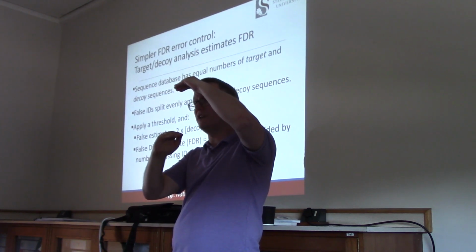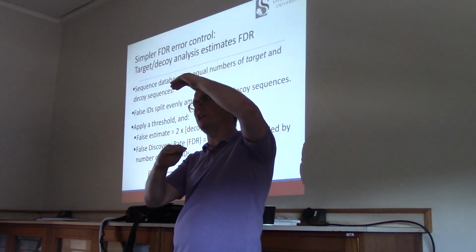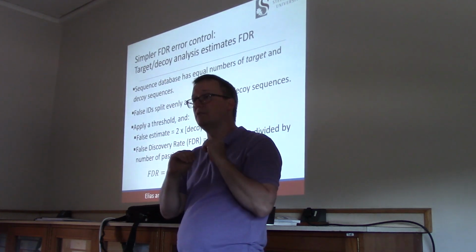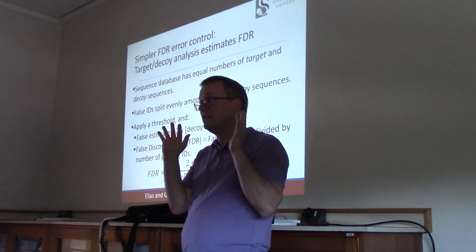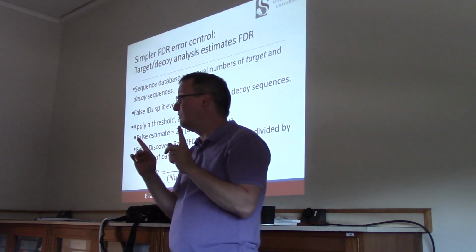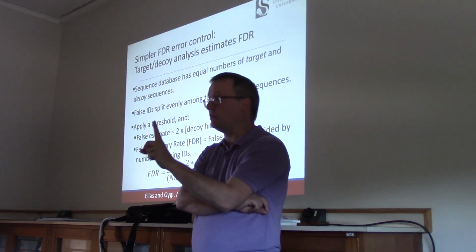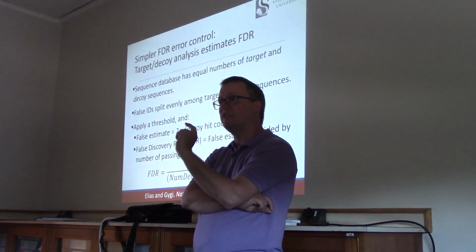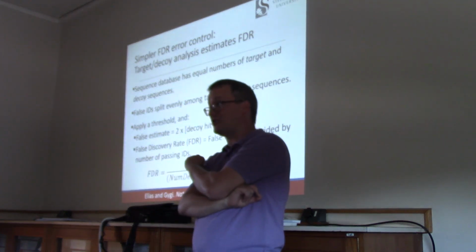Now, what if I lower the bar and I add to our collection a PSM that is associated with a target sequence? Do we know its status? We don't actually know. Because that sequence does exist in nature, it's possible that it was correctly identified. But it's possible that it was wrongly identified to a sequence that does exist in nature.